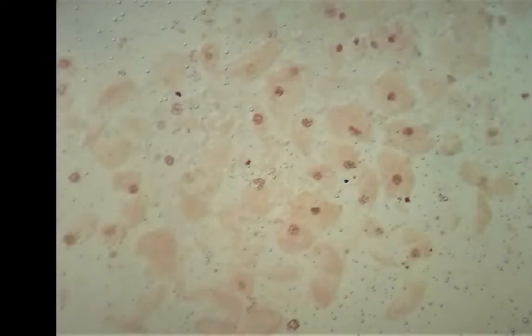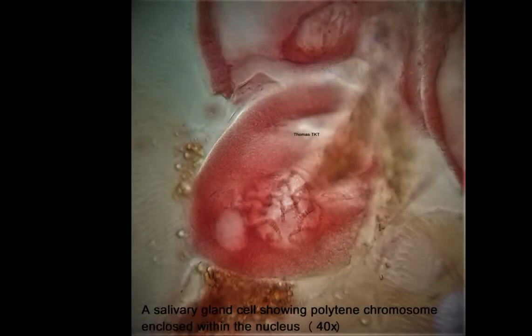Scan the slide under 10x for salivary gland cells. Locate the polytene chromosomes within the salivary gland cells and observe under high power. The images that follow are microphotographs taken of the slides prepared in this experiment.